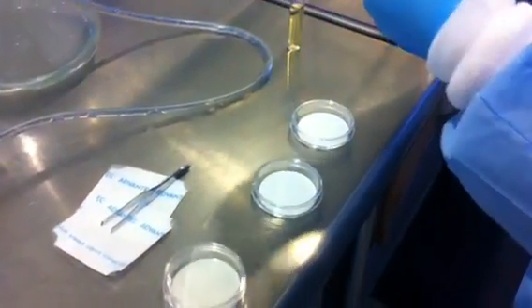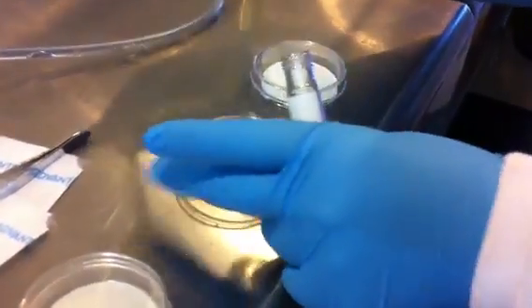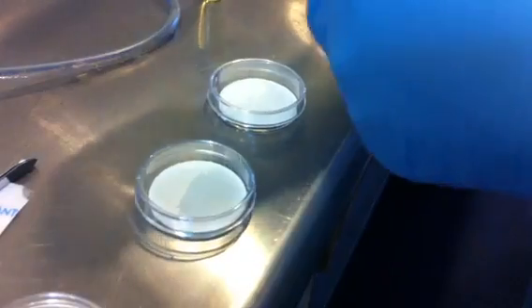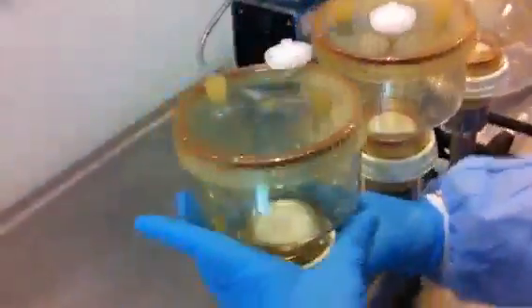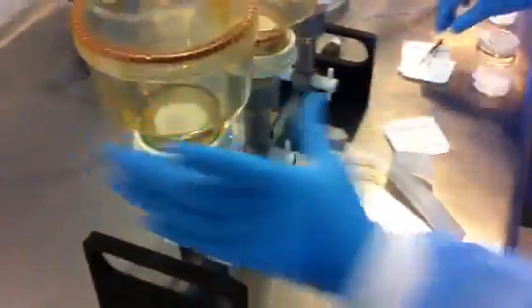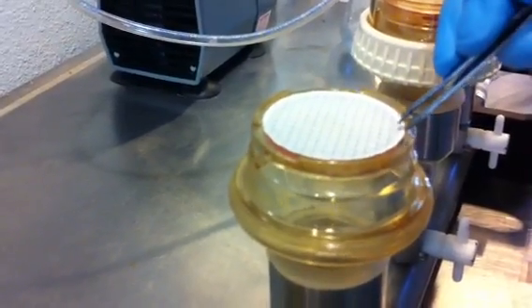Just enough to soak it. And while she's doing that, we're going to take off one filter — just one for the sake of time. She's going to take off the membrane filter aseptically and add it to the petri dish.